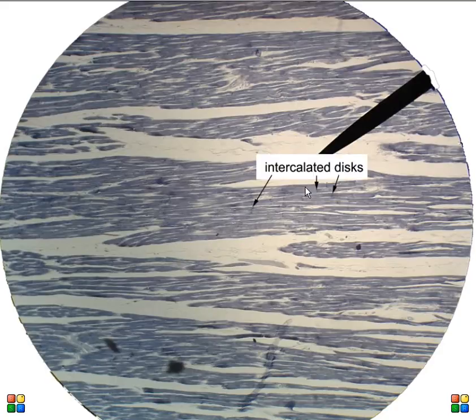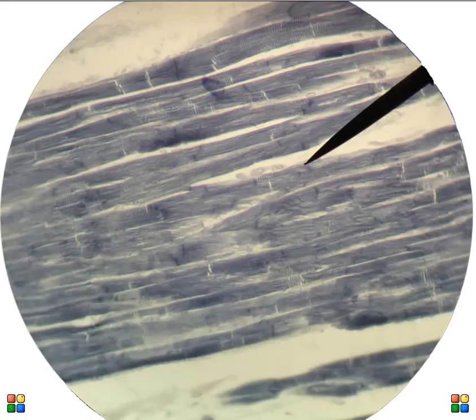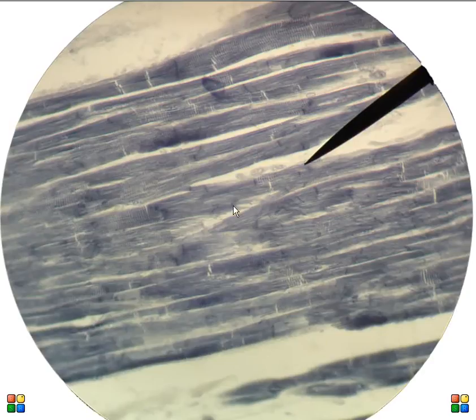There's some labeling I've done on a different picture to show you the intercalated discs. This is the highest magnification I have, 450 times magnification. And now you can much more easily see that branching that I described.